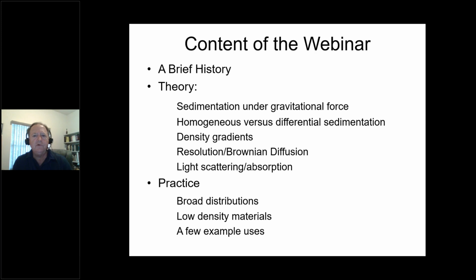This is the overall content of the webinar. I'll talk a little bit about the history of the technology, where it came from. Then we'll talk about theory of operation, how the process goes, and the different steps that are involved in calculating the final size distribution. And then finally, we'll have a few example practice requirements for broad distribution, low density samples, and some specific interesting applications.